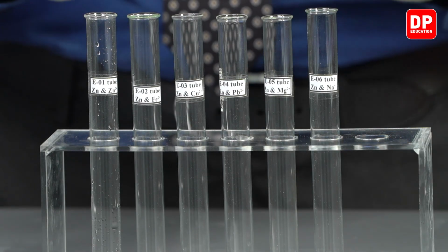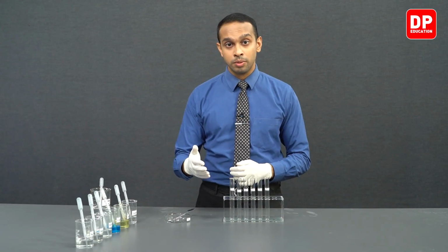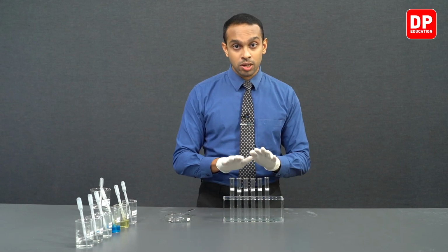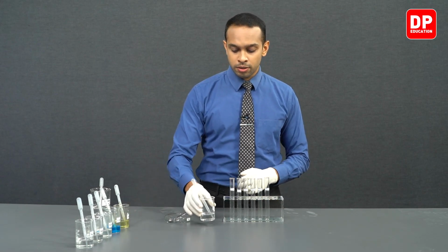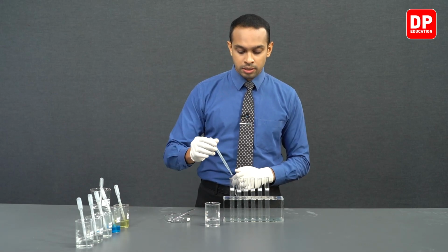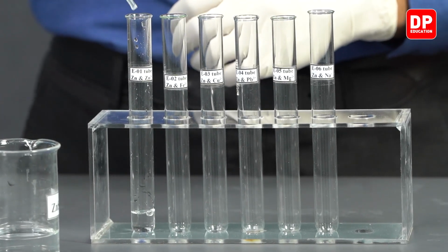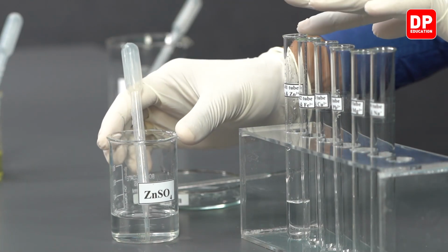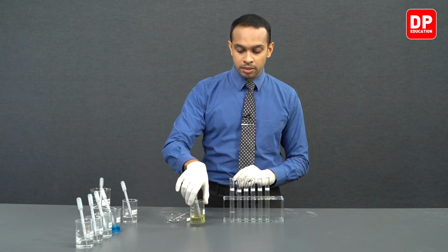So we have a few different solutions, and as we did in the previous parts of our experiment, we are going to take these solutions into these test tubes that are labeled. So we'll first take the first solution we have over here, zinc sulfate, and we'll add around 5 milliliters of zinc sulfate into the first test tube that is labeled Zn2+.